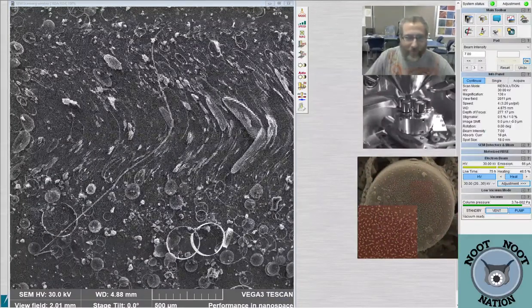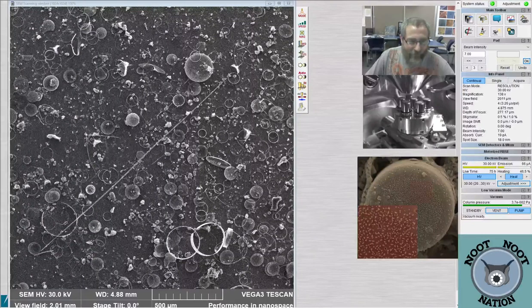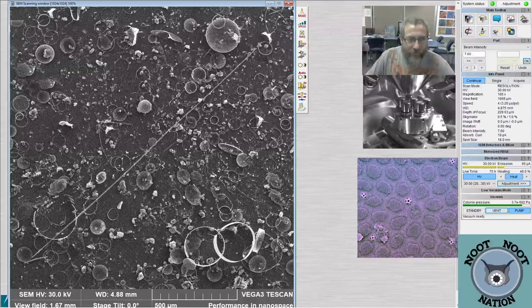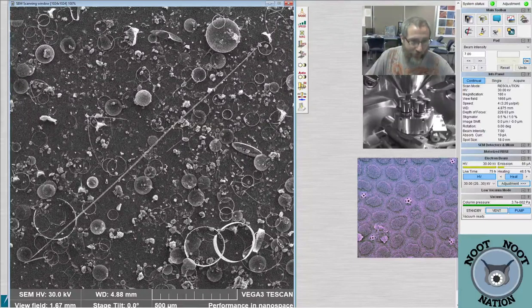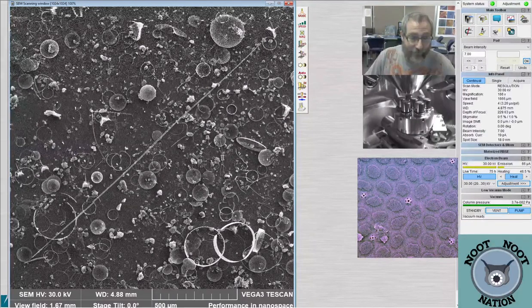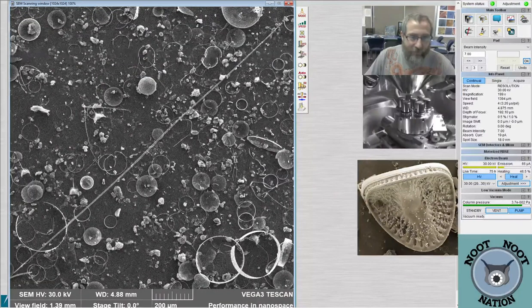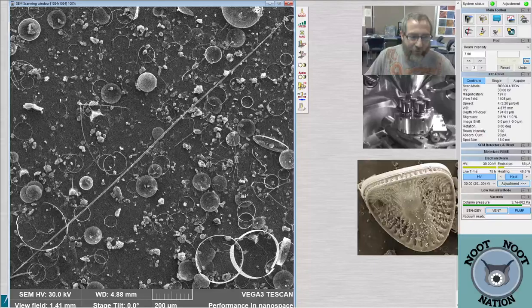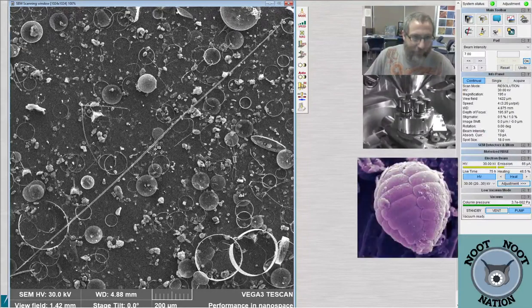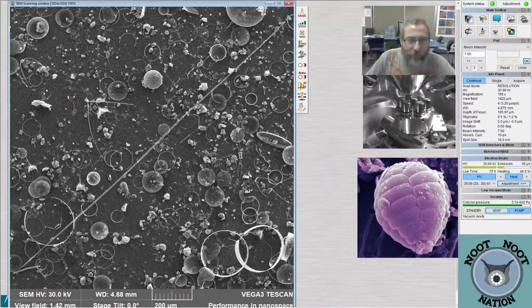All right. Terrific asks, so are they actually clones, not just separated? Or do they always have two mouths? It's not a mouth. It's the labiate process. So it's just a hole going through the diatom's skeleton, cell wall. It's mouth-shaped, but it's not a mouth. They don't eat, at least not the way that you think of eating, with a mouth. They just absorb nutrients through their pores, for the most part.